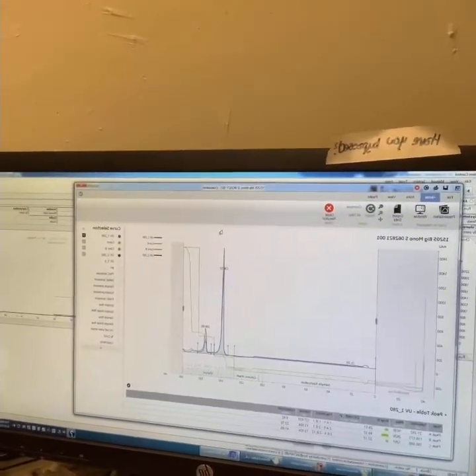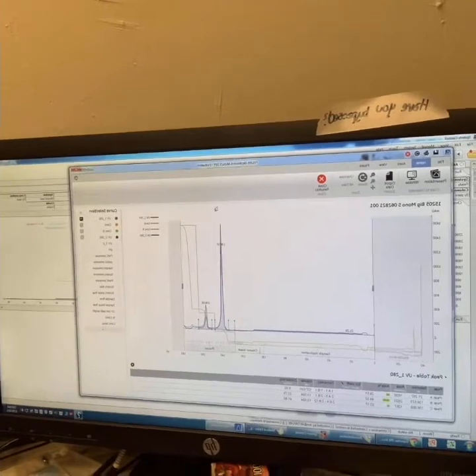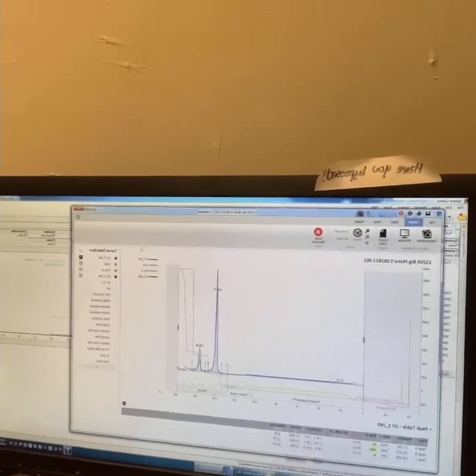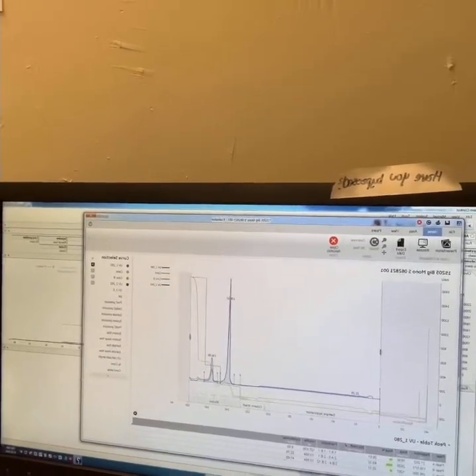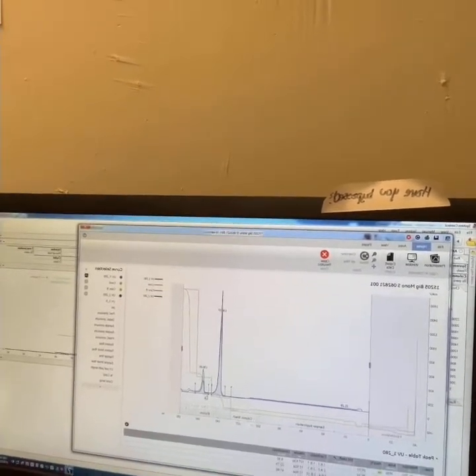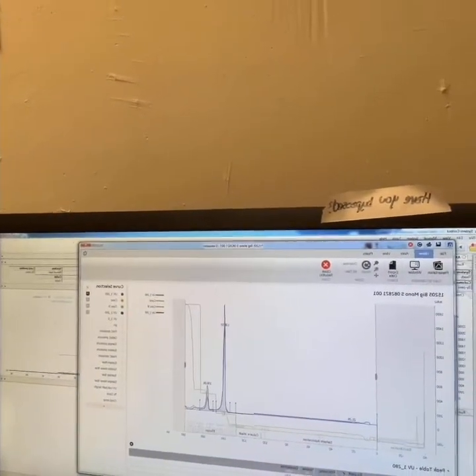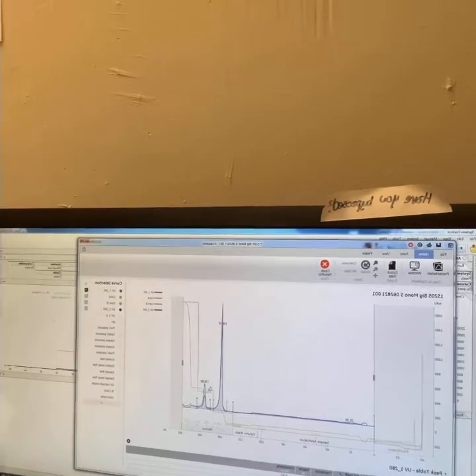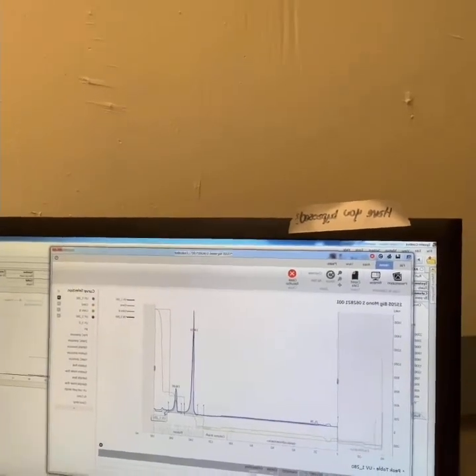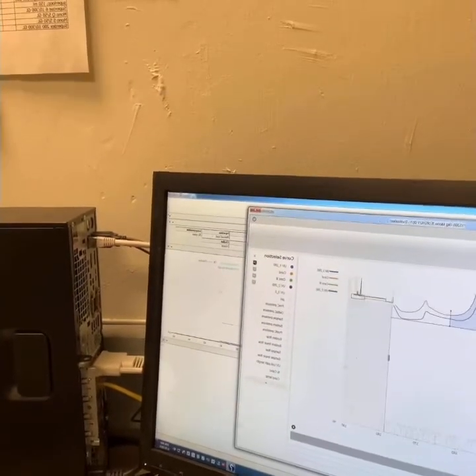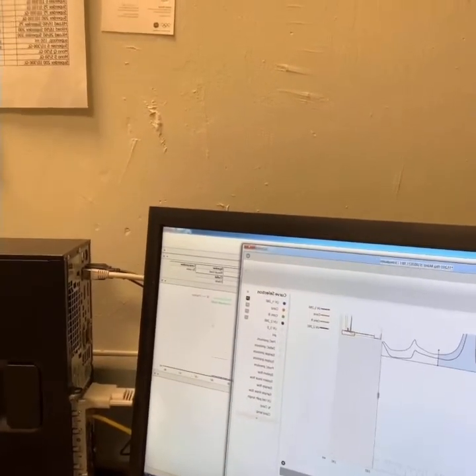So the resin was binding to the protein based on charge, and then I competed off with increasing amounts of salt. So here when I have a lower salt you see this peak representing the less positively charged fraction. And then when I up the salt I get this more positively charged fraction. So it's positively charged because this is a cation exchange column. I just wanted to show you the chromatogram. And so what it's doing is if I zoom in I can see what fractions it came out of.